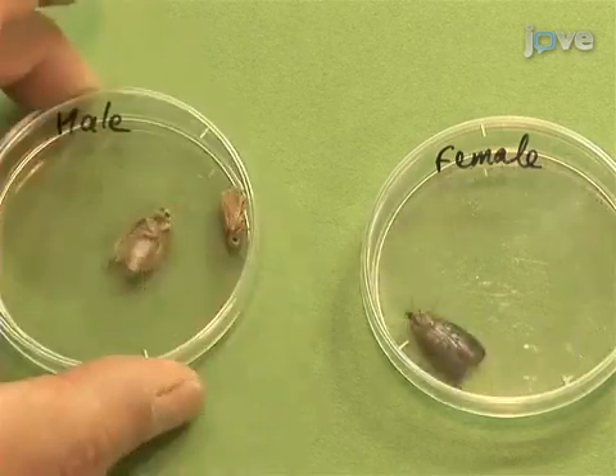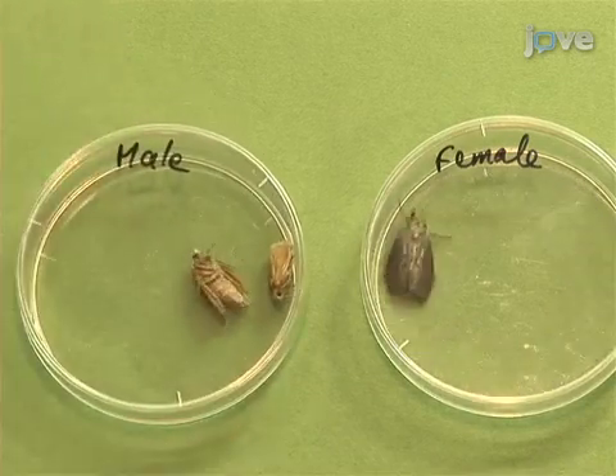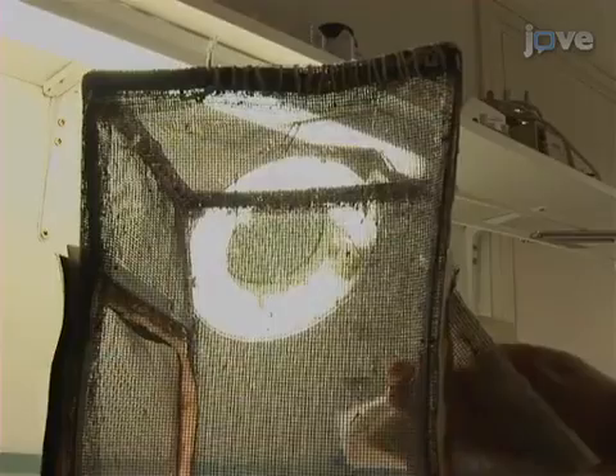Female butterflies measure around 20 millimetres. Females are darker than males with a brown to grey colour. Place at least 100 pupae or newly emerged Galleria mellonella butterflies in a container.